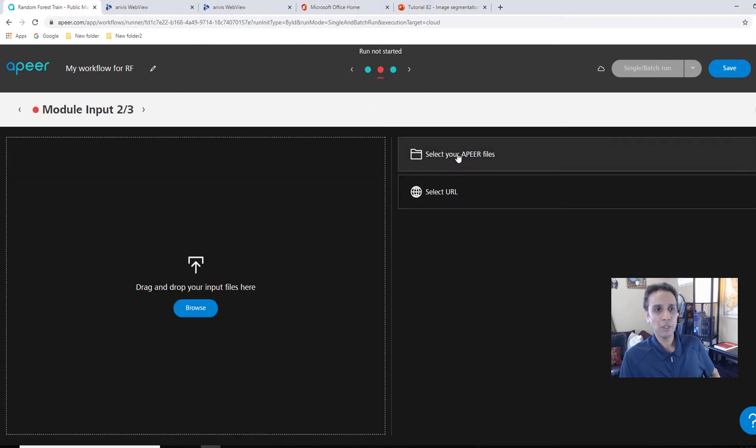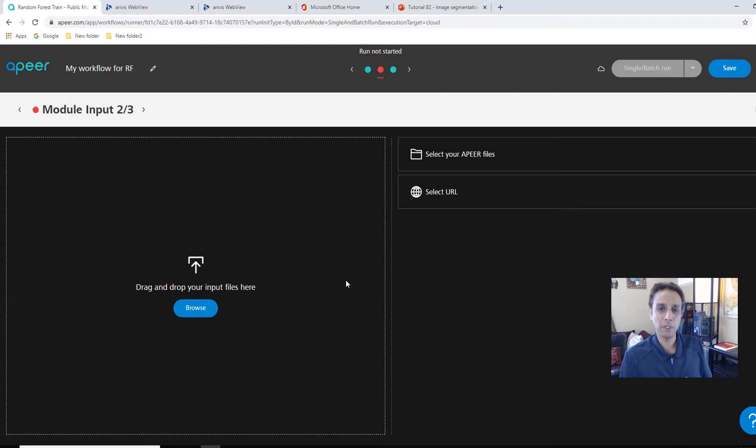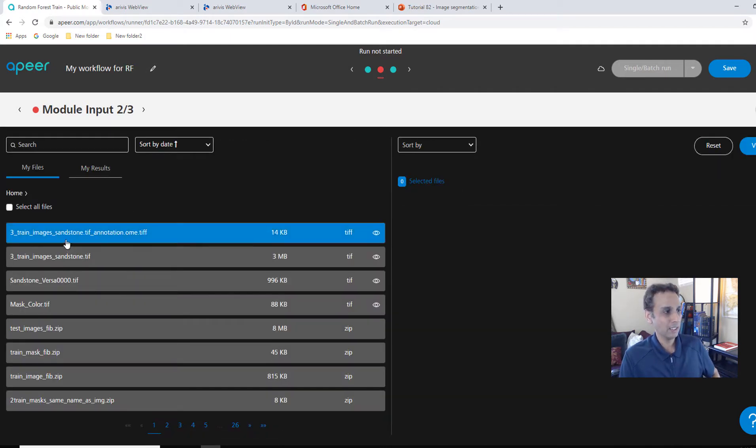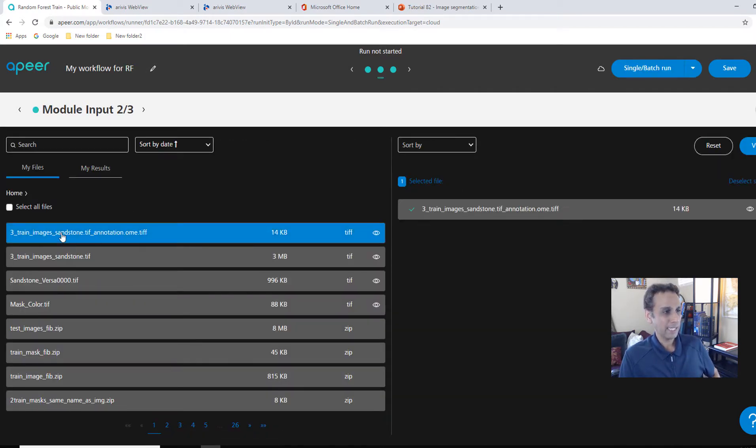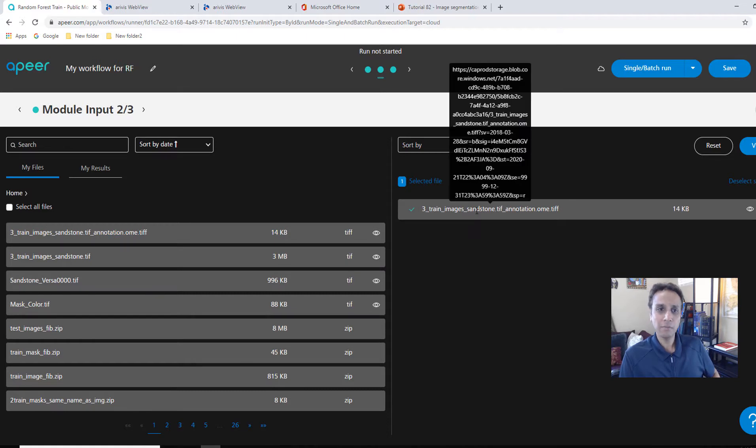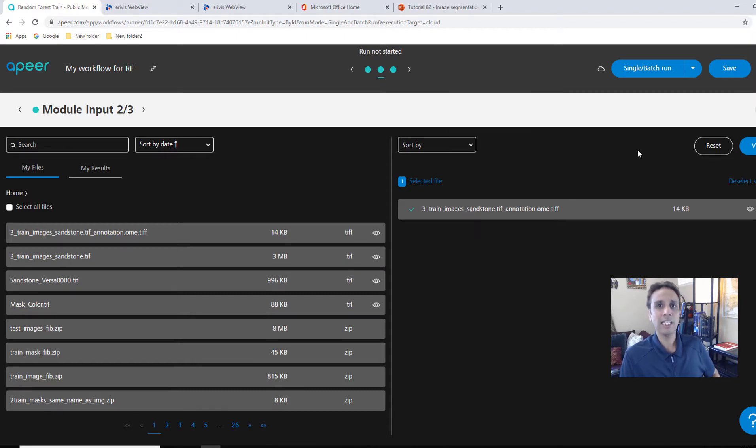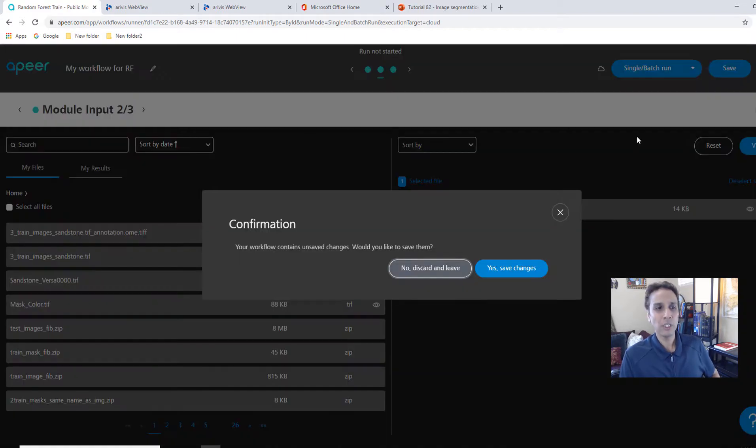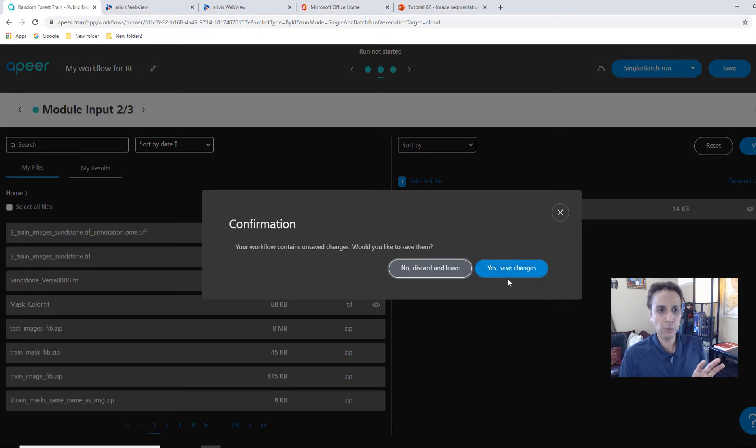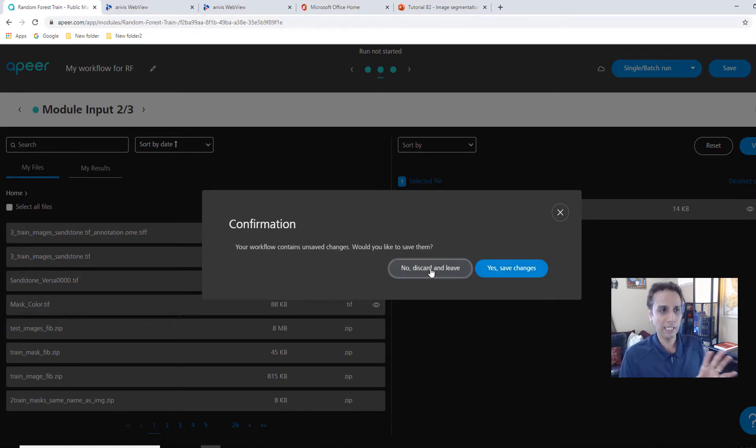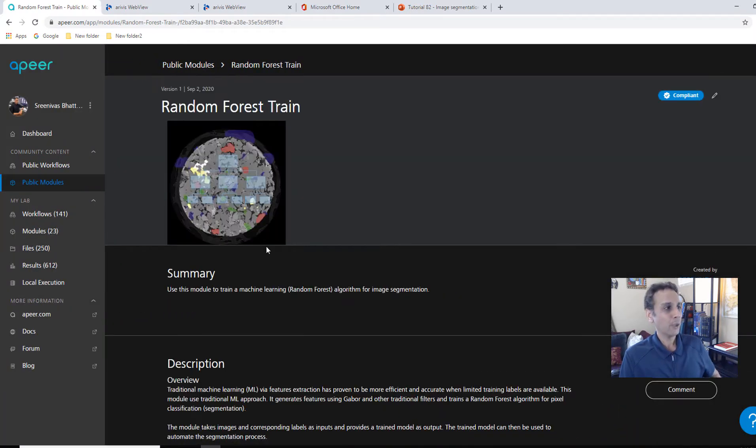Let's go ahead and add a step in between for input module input, and then let's connect these two. It's very easy. And once you, while we are doing this, let's go ahead and this input is train stack. Let's go ahead and select APEER files. I'll tell you three train images. So this is a stack of three images. Let's go ahead and use it.